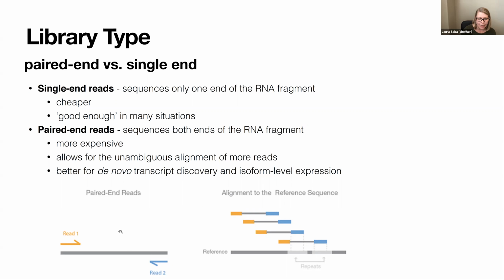If the reads are aligning to 2 different chromosomes, then there may be something wrong with the alignment of that read. Or, if the read aligns to multiple places, it may help you attribute it to the area of the genome that makes these what we call concordant.